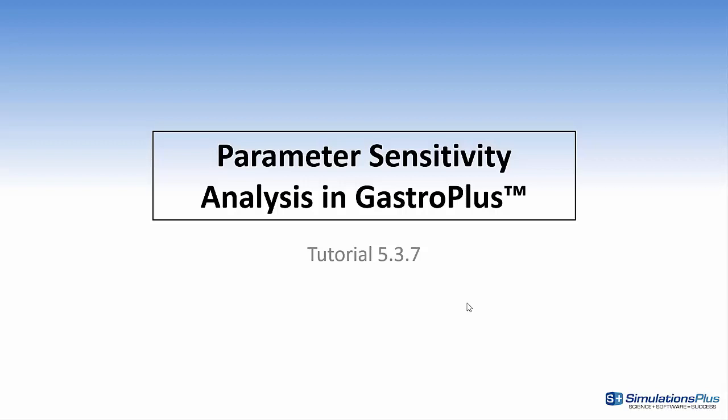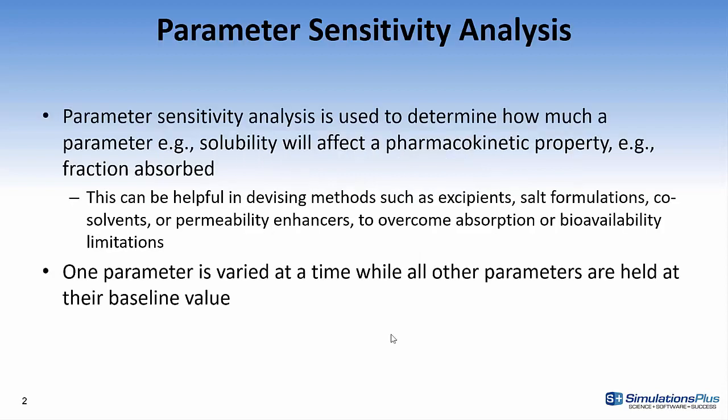Hi, this is Mike Lawless, and in this video, I'm going to discuss parameter sensitivity analysis in GastroPlus, and I'll be performing tutorial 5.3.7.